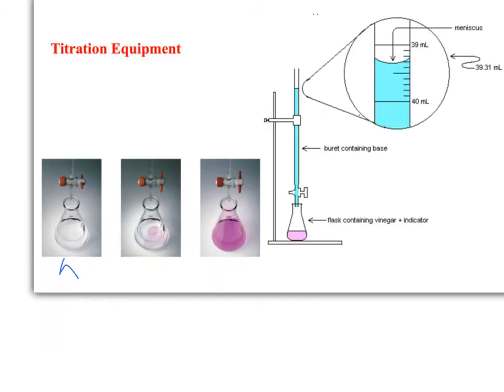Now that we have our 20 mils in that flask, this 20 mils is called an aliquot. It's an exact amount that's put in the flask.